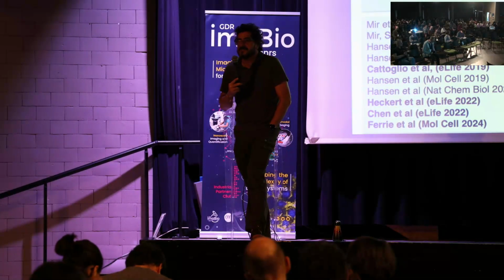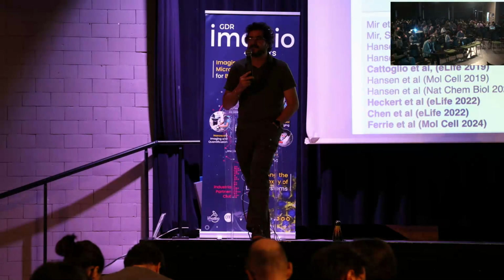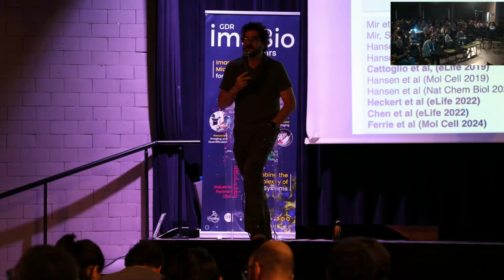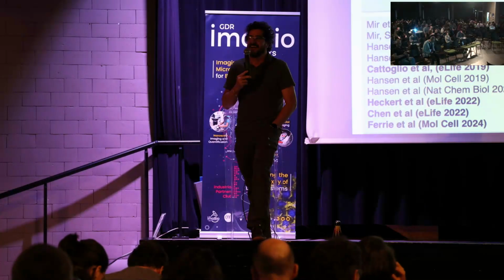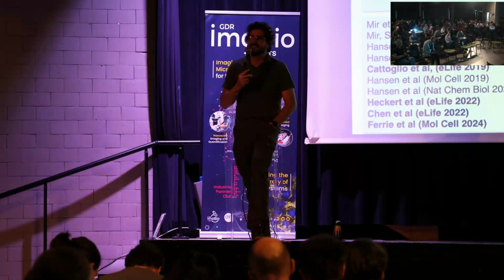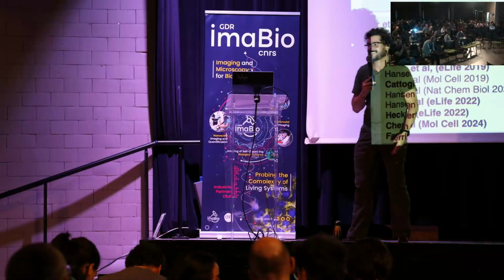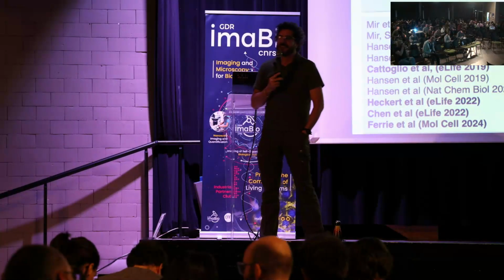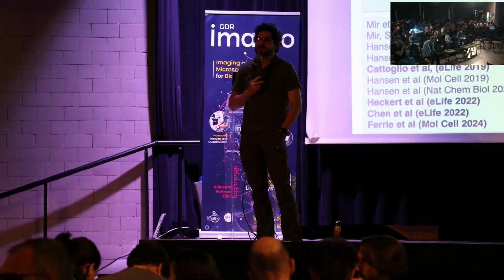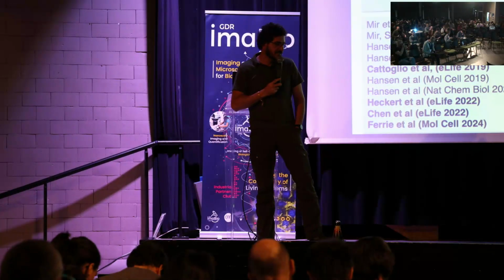It works with some dyes, with some others it doesn't. So I agree with you. There are a lot of different options to make it work with different fluorophores. I would love for photophysicists to go after that, because it would be much, much easier to use a principle that is understood to measure protein-protein interactions than to say, hey, we characterized this, we don't know how it works, but it works. I think it's super nice, and I don't know if you've done it yet, but exchanging that green fluorophore for a blue or a violet really could let you do multiplexing in this experiment.